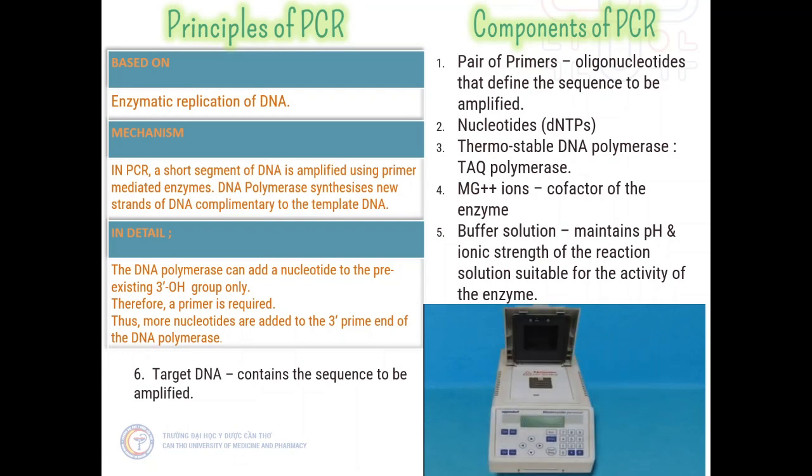The actual test being run for diagnostics is a quantitative PCR. Here, the primers are paired with a probe that gives off light during every round of PCR amplification. This is called fluorescence. As exponentially more copies are made every round, more light is generated. We plot this light intensity per round of amplification on a graph to determine the initial viral load. An infected person will have a very large titer, easily detectable.